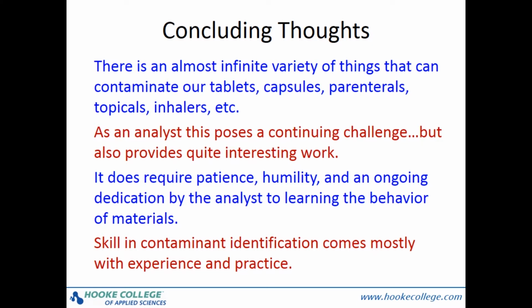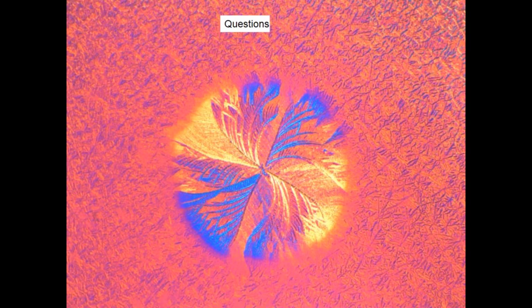So I found that contaminant analysis was really a rich and rewarding part of my job in R&D, and I hope that you find it to be so as well, and I hope that this webinar has helped you. As an aside, I nearly always padded my contaminant work with an hour or two of skill development. So if I'm doing something with the IR microscope, I might have spent an extra hour learning a little bit more, testing a few other samples, practicing my sampling skills, etc. What I found is that it's nearly always easier to justify a little extra time on a particular contaminant than it is to try and devote a whole or half day to building your skills.